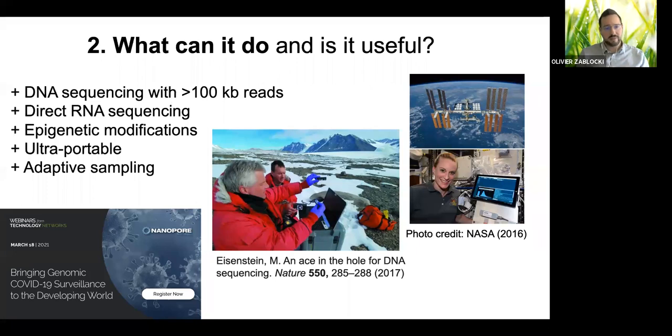And in real time, the software will read the DNA and discard the sequence that is not of interest as it sequences, so that you perhaps do not have the need to prepare your sample too much beforehand. You can just tell the software, I'm looking for this particular sequence, and as it sequences, it will discard anything that's not that sequence. It's another way to do things, but I don't know much more about it.